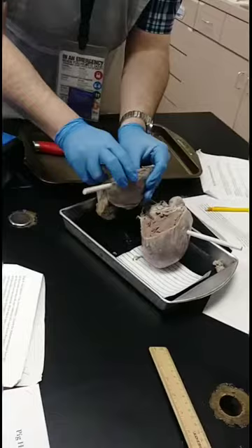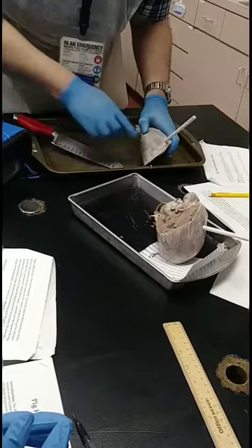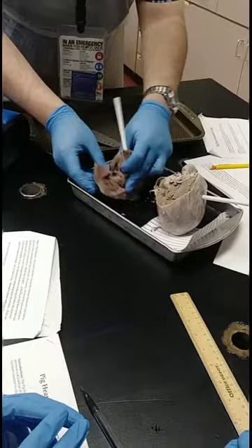We open up to the right ventricle, and that's all this inside. Okay. You have a little more fat in your heart, and you also have more of a membrane, pericardial membrane, underneath of that. So it's a little harder to see than the other one. But here is the right ventricle.